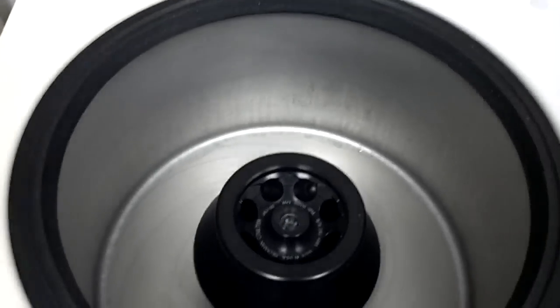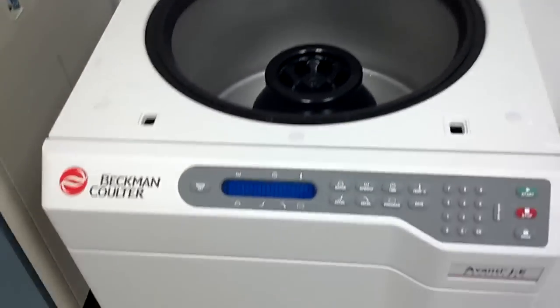This is another one of our centrifuges. This is the big boy. It can spin up to around 25 to 30,000 RPM.